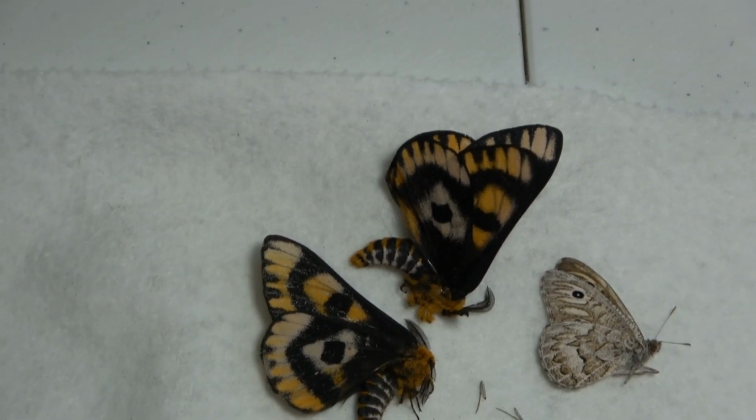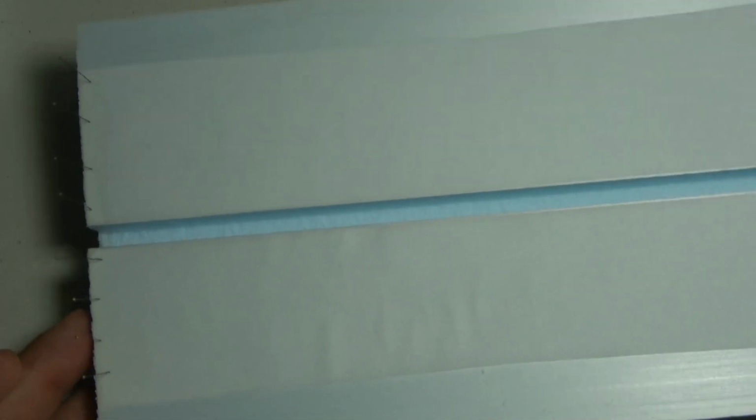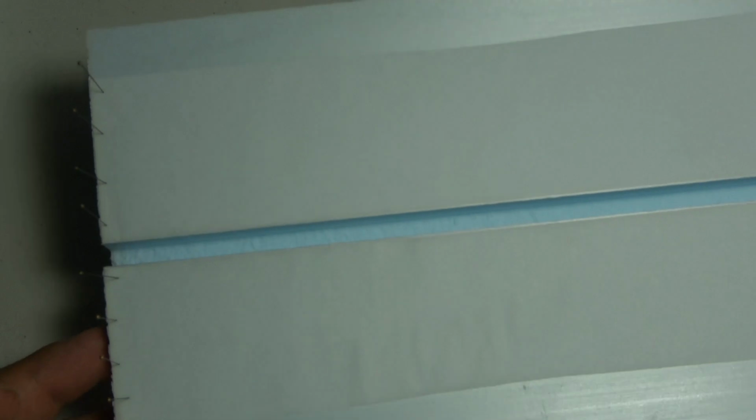In this pinning short video, I am going to show you how to spread butterflies and moths. So first off, you're going to need a spreading board. I use the blue spreading boards from BioQuip. Just Styrofoam, and they work wonderfully.